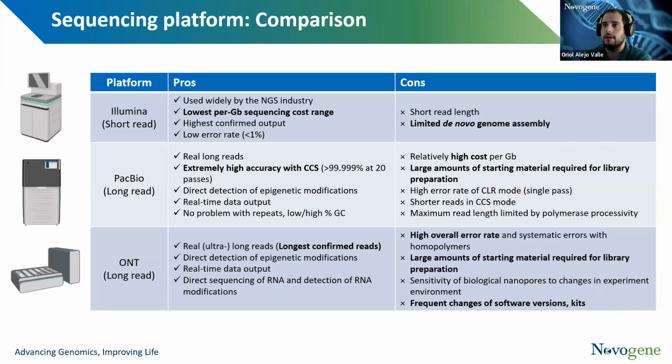Thanks, Larissa. I think it's really clear. So now jumping from long read sequencing, we have some questions regarding target region sequencing instead. And Lola asked if you can target sequence an entire chromosome, let's say 50 to 60 megabases, instead of the whole genome. And yes, you can certainly do that.